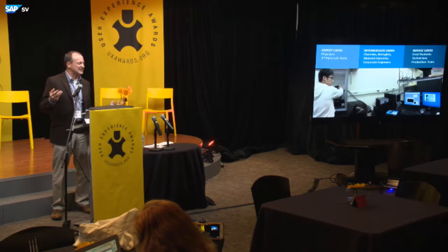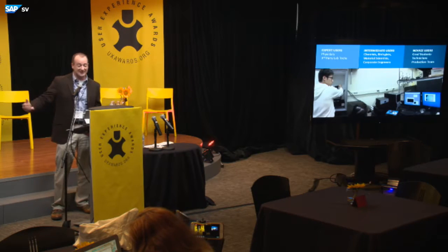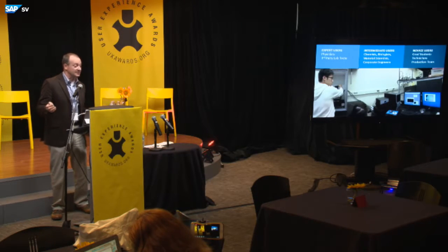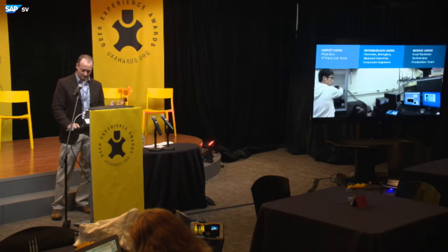We began to get some notion of how the design might need to take shape, because people would need to use it while sitting at the desk as well as from across the room. And with the new machine, because you're spending $500,000, it comes with a 32-inch monitor.